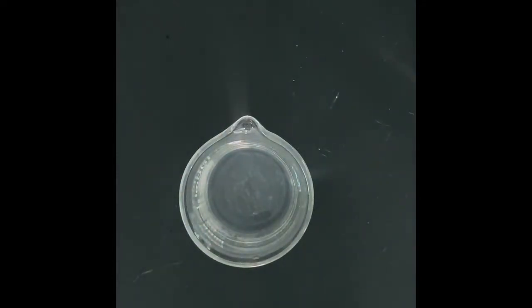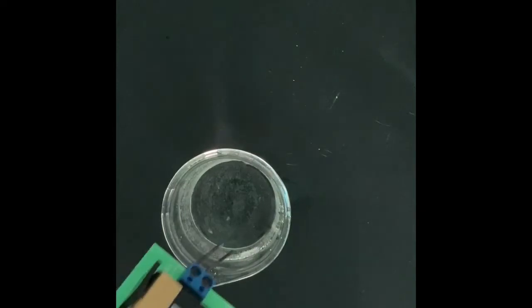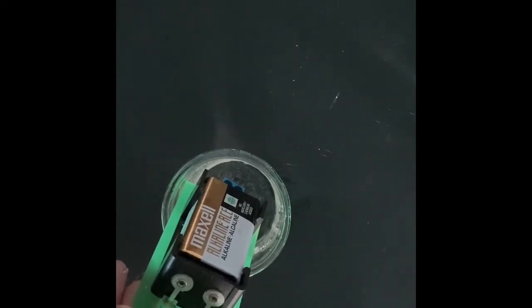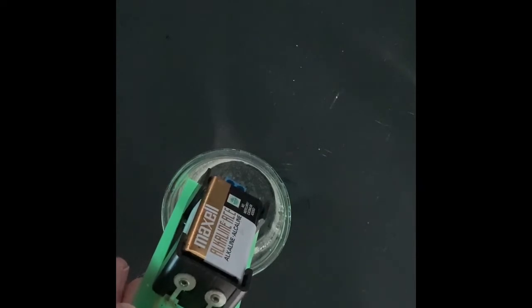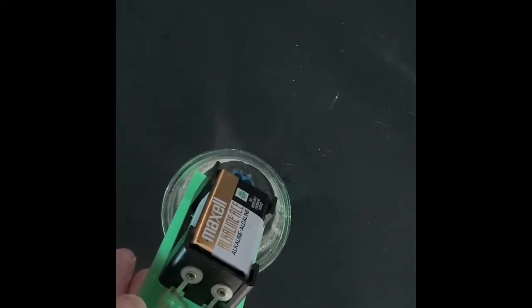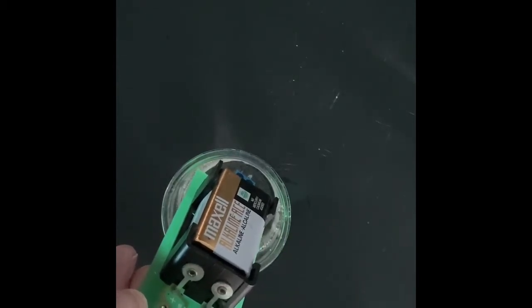our key here. Next up, we have citric acid. All right, I cleaned off the electrodes, so we'll see what happens here. So notice the green is not as glowing, bright, but the red is lit up a little bit. The key says that bright red and dim green would be a high conductivity. Medium red and no green would be medium conductivity. So sorry, this one says high. Dim red and no green is low, and no colors is low or no conductivity.